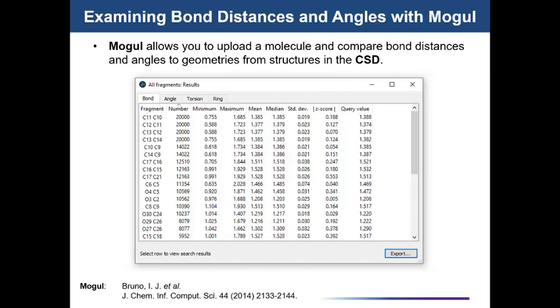And basically what you can do is, I typically would take the mean and the standard deviation, and you can put these into GSAS to provide constraints, the way Bob was explaining constraints this morning. And you can do the same thing with all of the angles. Typically for the torsion angles, I would not constrain those. Often if you're looking at a new structure, one of the most interesting things can be the actual torsion angle that gets refined and comes from your data. So you sometimes don't want to restrain things like that.